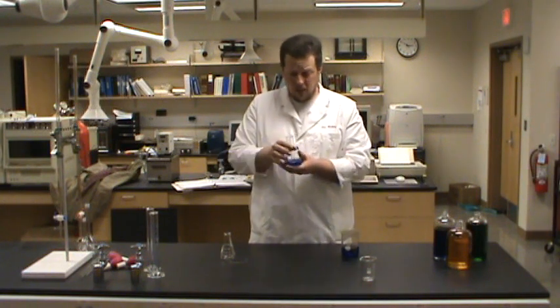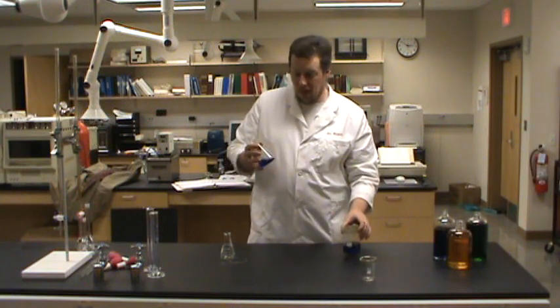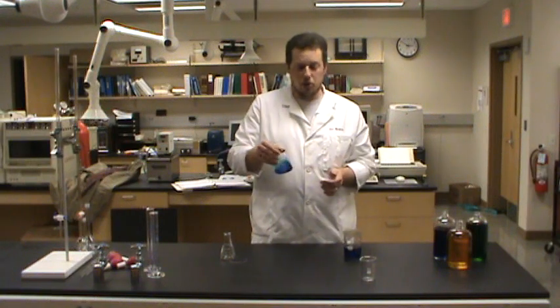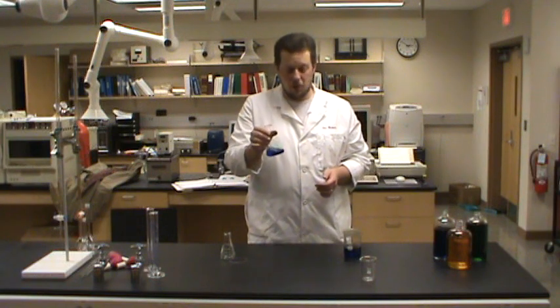Erlenmeyer flasks, as far as their accuracy, are probably no better than a beaker. But if you're doing something that you want to put a cap on or that you want to swirl vigorously, Erlenmeyer flasks are definitely the way to go.